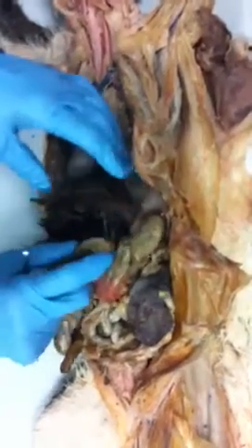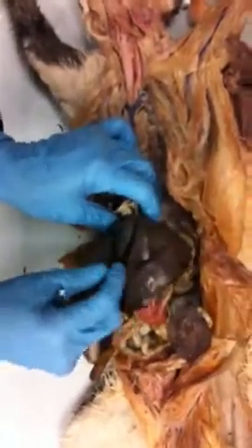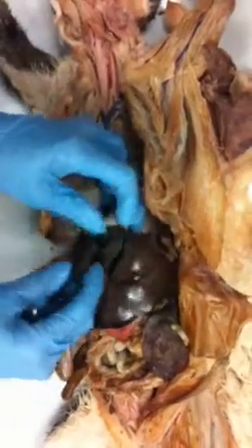Right? Also, right at the beginning of that duodenum, let's pull this is our liver, right? This little... Do you have to know the lobes of the liver? No. They're listed in them. No, you don't need to know the lobes.